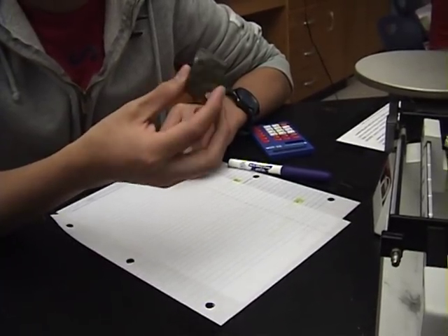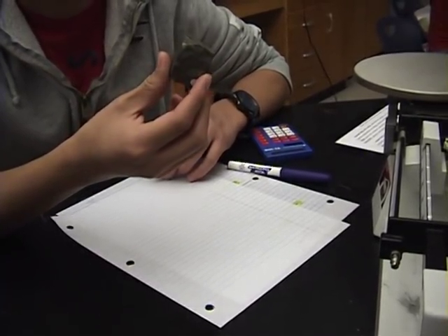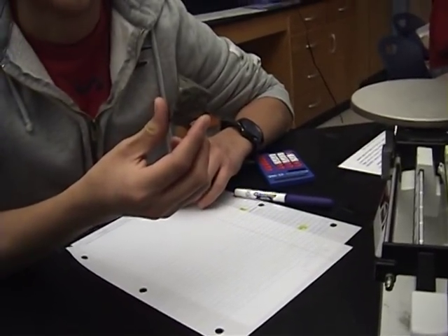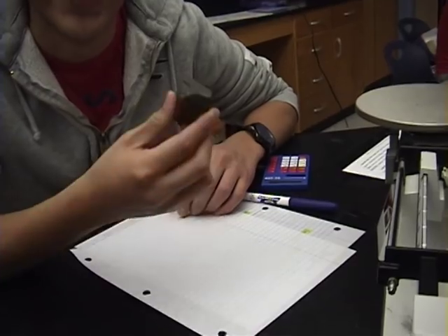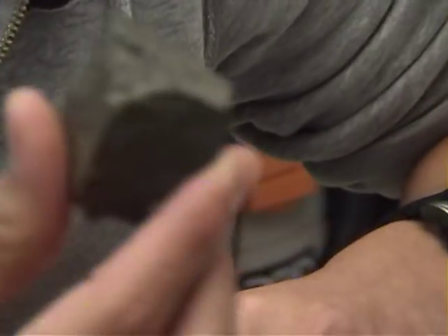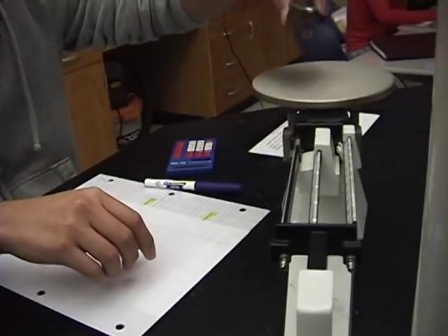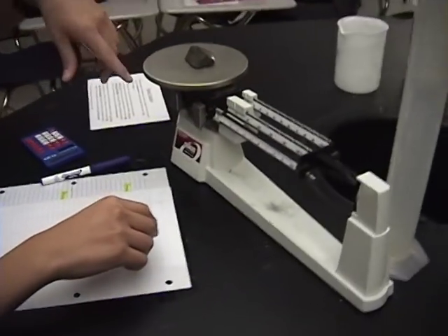Hello. This is basalt. Look at it. Yes. Alright. So today, we'll find the density of basalt. First of all, you find the mass of basalt. You put it in the triple beam balance.